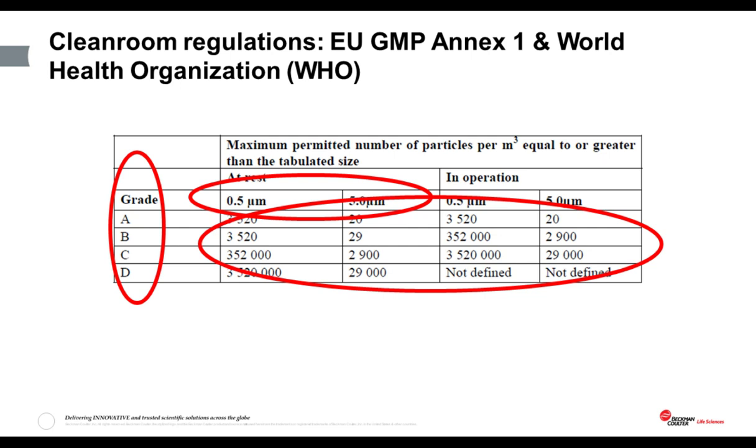All particle counts are reported in particles per cubic meter for both GMPs, and this itself can present an area of potential error, because in order to reduce the amount of time taken in routine environmental monitoring programs, the sample taken at each location is often just a 1 minute sample.